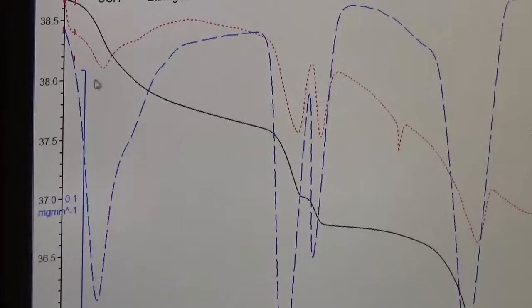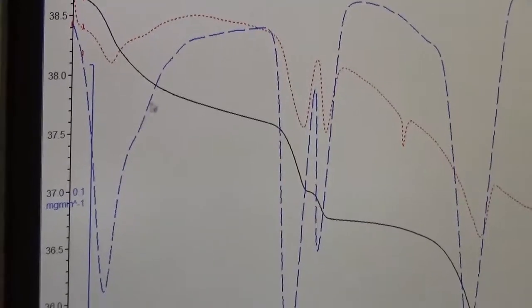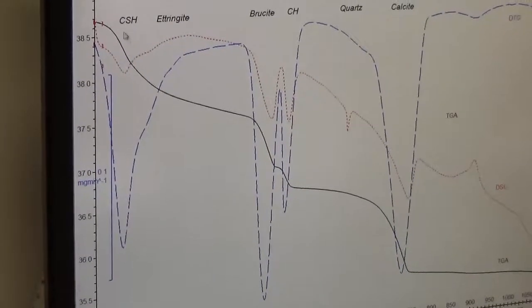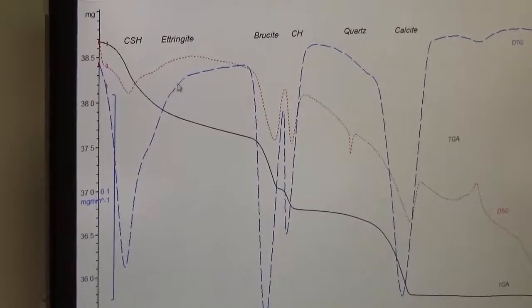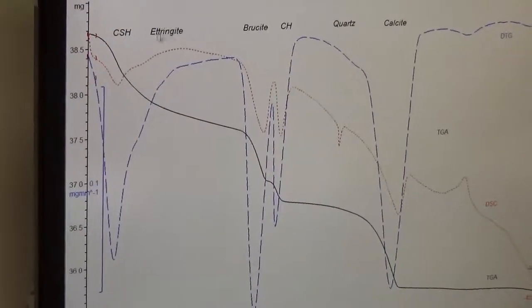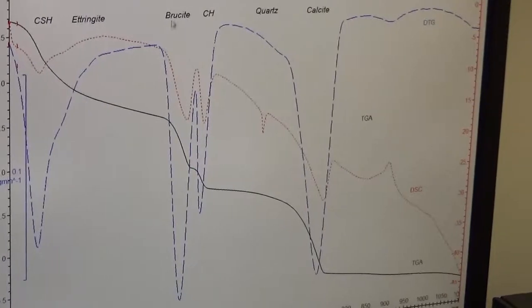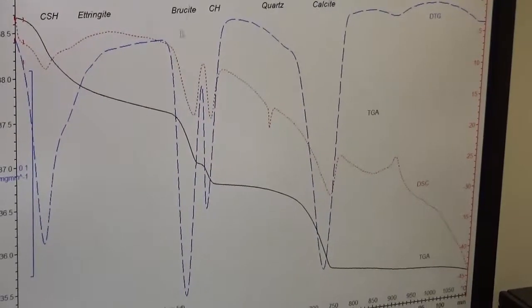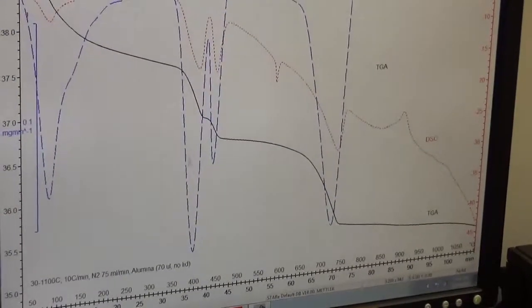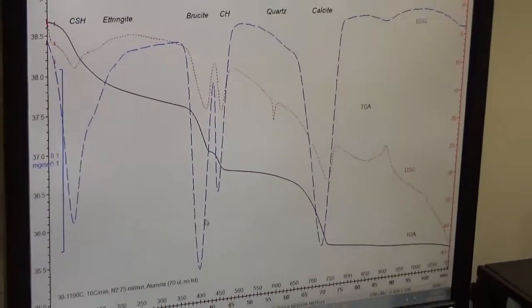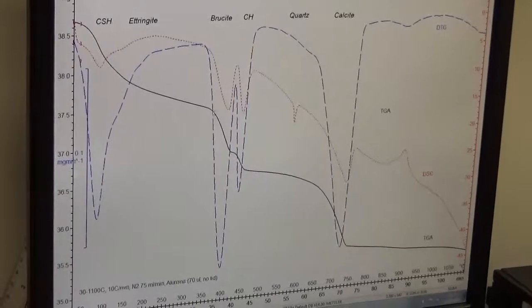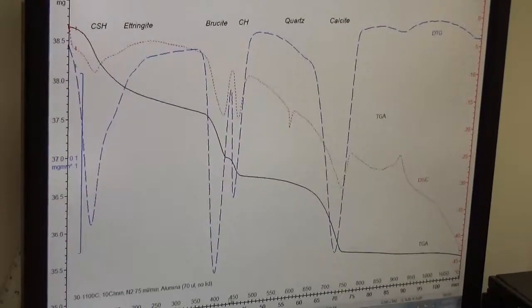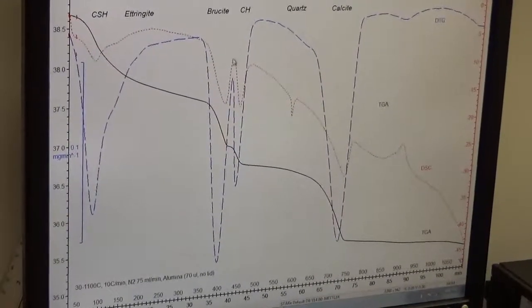This peak corresponds to the weight change due to dehydration of calcium silicate hydrate. Then a small bump comes from dehydration of sulfate — the ettringite in the Portland cement paste. Then the brucite that we added: the dehydroxylation of brucite happened around 400 degrees centigrade, and you can clearly see a peak in the DTG curve from brucite dehydroxylation, as well as in the DSC curve. Next one is around 400 to 450 degrees where calcium hydroxide dehydrated, clearly shown by both the DTG and DSC curves.